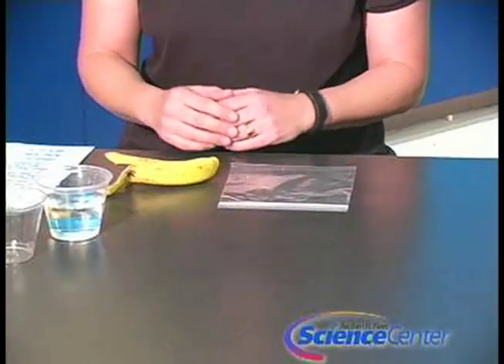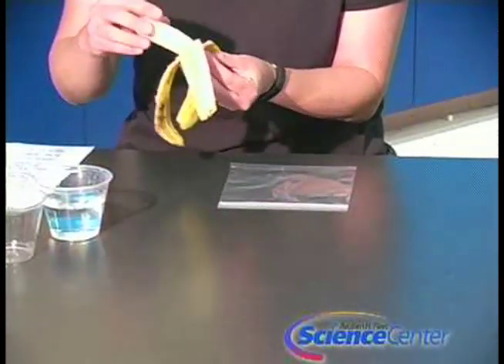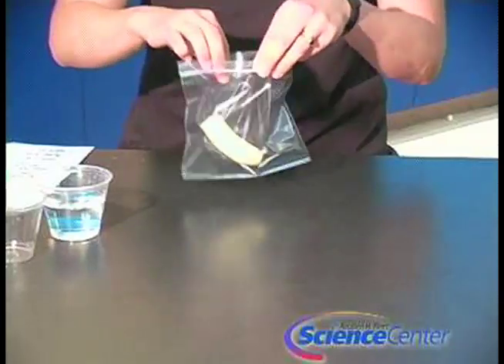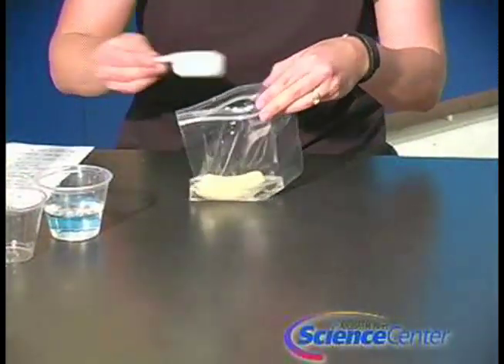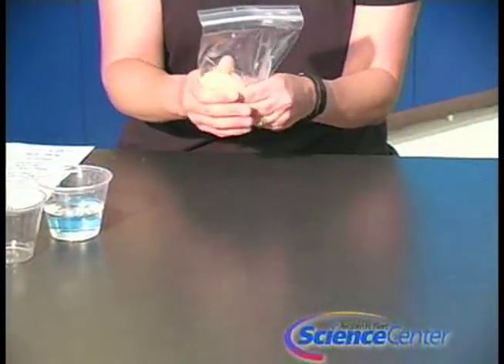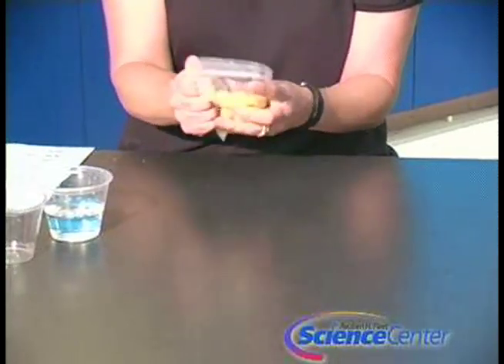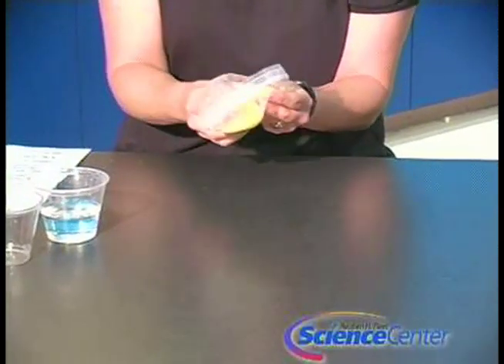For the banana DNA extraction, you'll need one half of a banana, peeled, and a resealable container. Place the banana in the baggie with one fourth cup of distilled water. Then seal the bag tightly and really squish up the banana — you're going to make a slurry. It's going to be gooey, but that's okay. The more you do this, the better it will become. Crush the banana for about two to three minutes until you get all the chunks out.